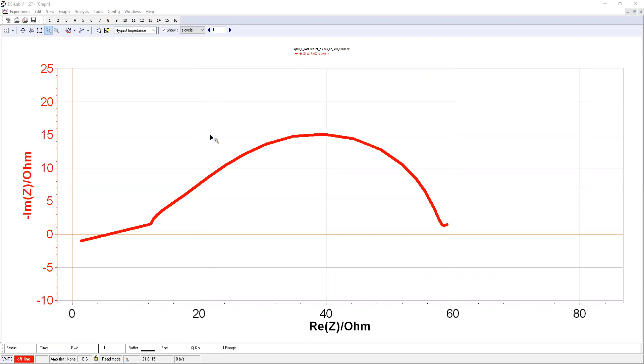Hi, so here is the EIS raw data after the cycling. I'm going to feed this one and show you how you can go through the process.